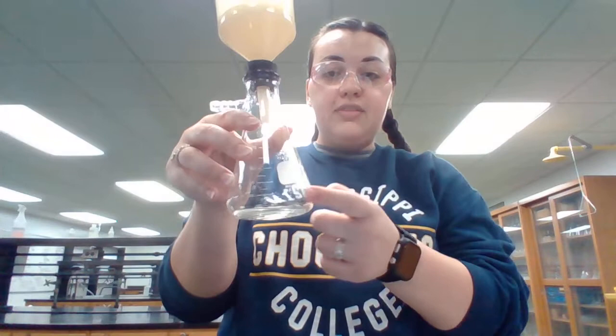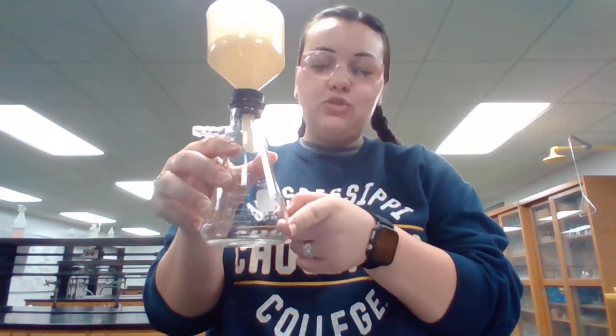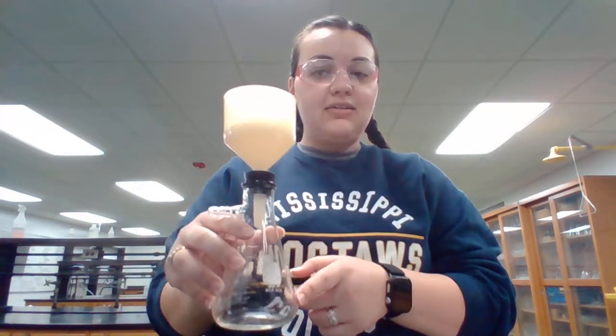It tells you to filter the undissolved particles, so the particles that were very large and you can actually see in the bottom of the beaker. You're going to be separating those out from the liquid, from the solution. And so you're actually going to be doing 2 filtrations. For this first one, you want the liquid. So whatever liquid you collect in the bottom of this for this first filtration, you want to keep that.